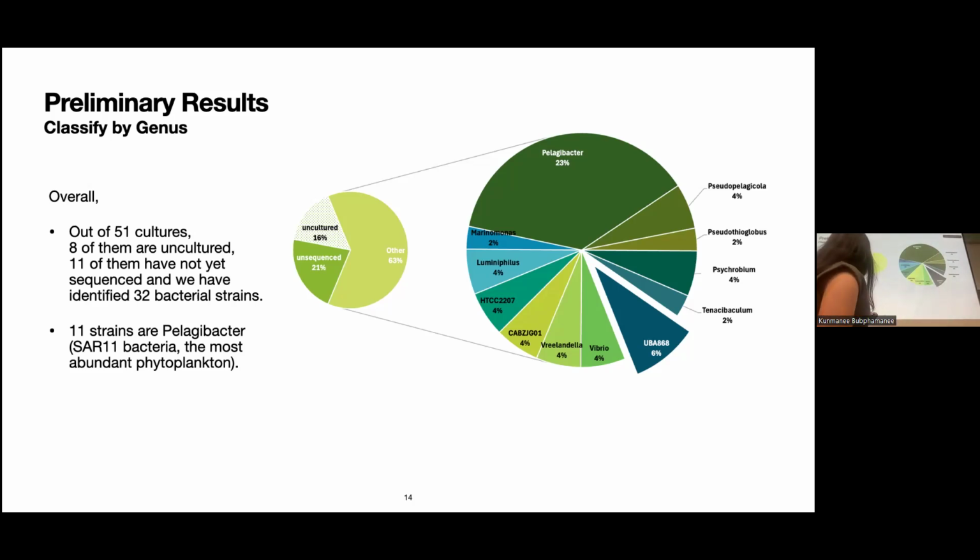But like I said, some come out nicely and some I have to dig through to find out who they are. And these UBA868 gave me a hard time because they take so long to grow, I believe like 2 months. And when we harvest them, the cell density does not get that high, and it reaches a threshold where we wonder, should we collect it or should we not collect it? And when we try to identify it, it doesn't give me the name right away.